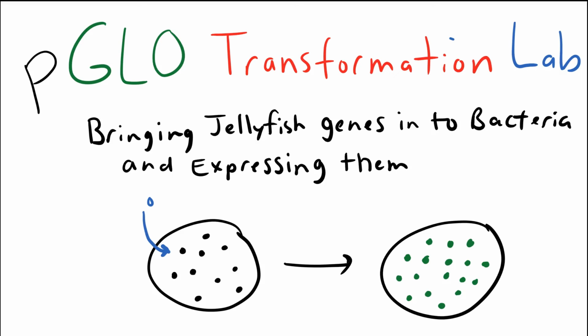Hi everyone, Dr. Ron Bauer here to explain some of the principles involved in Bio-Rad's pGLO Bacterial Transformation Lab, as well as to review the basic protocol and what to expect when you're doing this lab.